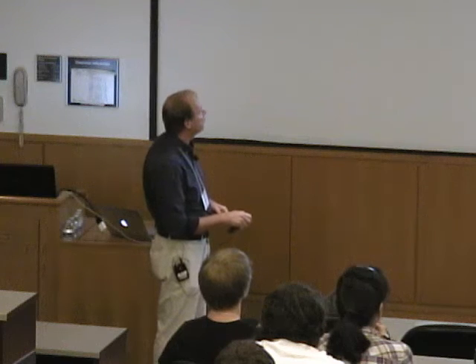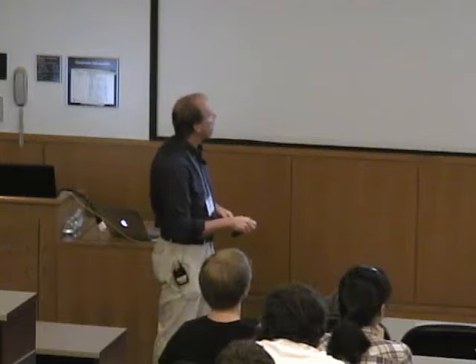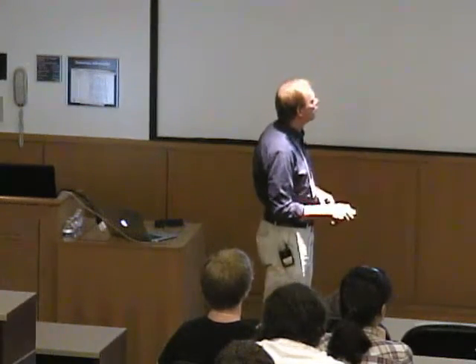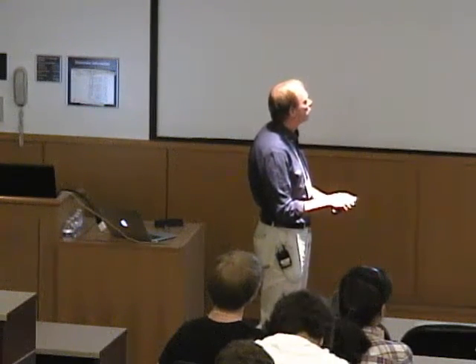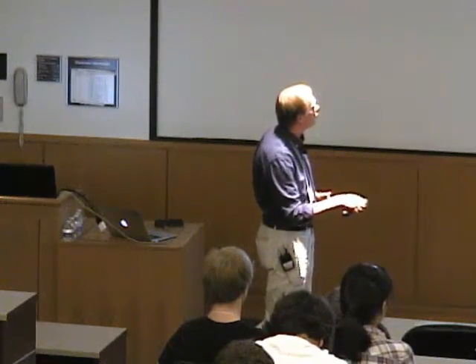If we look at an organic molecule in its triplet state, the values of D and E are usually smaller than the interaction with the magnetic field, and so we get an energy diagram like this, in which the main interaction is the interaction with the field. So we have a splitting between our ms equals 0 and -1 and +1, but the energy gaps here and here are different, as a result of this zero field splitting, and so our spectrum has two lines at different magnetic fields, right? So we have a transition here and here.